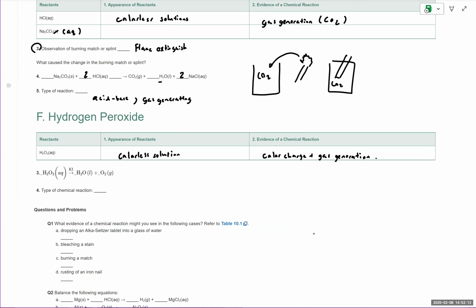Now, in terms of balancing this equation, as you can see in this case, for hydrogen peroxide leading to water and oxygen, the potassium iodide is not a reactant or product, it's a catalyst that facilitates the decomposition of hydrogen peroxide. There are also some side products from direct reaction, but we're going to focus on potassium iodide as a catalyst. The potassium iodide as a catalyst is neither consumed nor produced in this reaction.